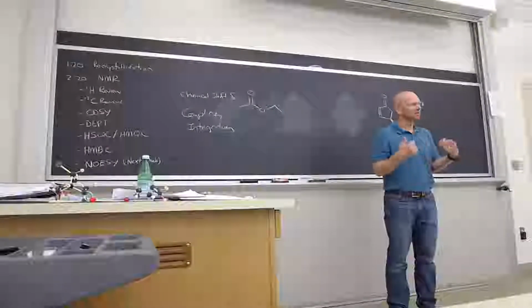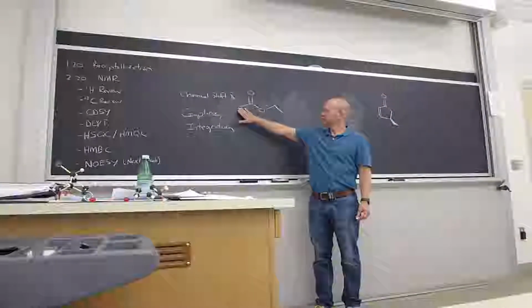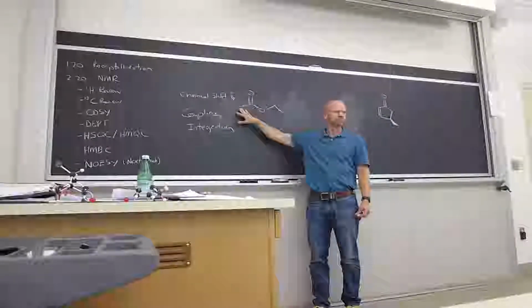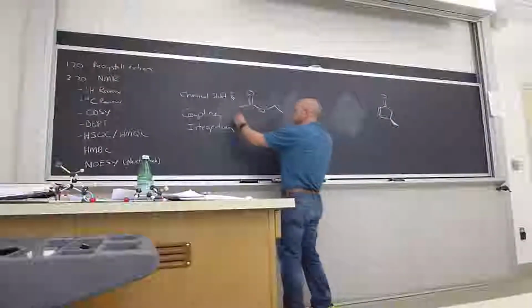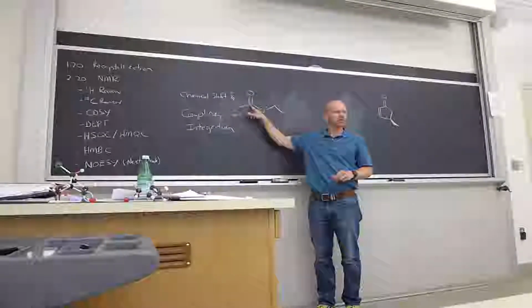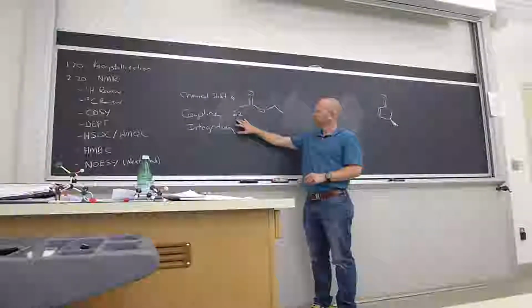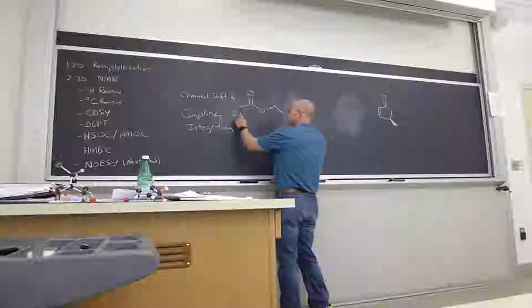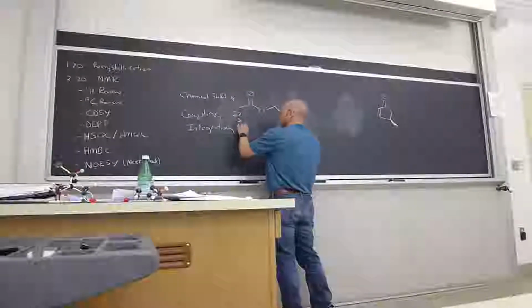Okay. So we're back. Let's actually do this together. Let's do them in order: chemical shift, coupling, and integration. Chemical shift estimation for these 2 protons. 2, yeah, 2-ish, a little more than 2. So delta of 2. We found that on the table because that's a proton on a carbon next to a carbonyl. So delta of 2. Coupling: what multiplicity would we expect to see for that? Singlet, right? And then integration. 3, yeah, 3 hydrogens. Okay.